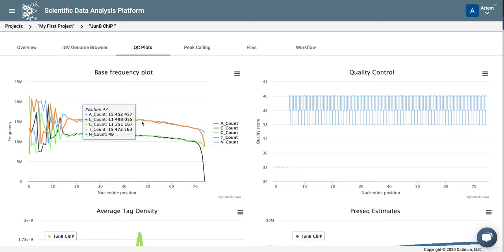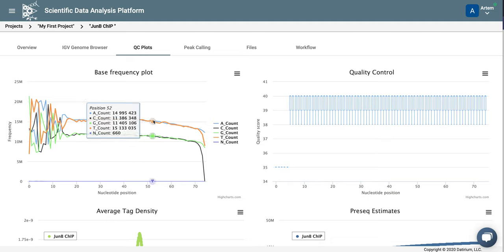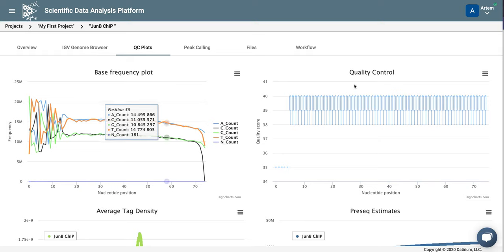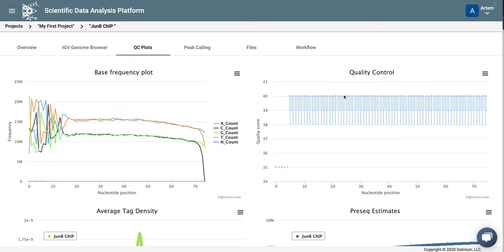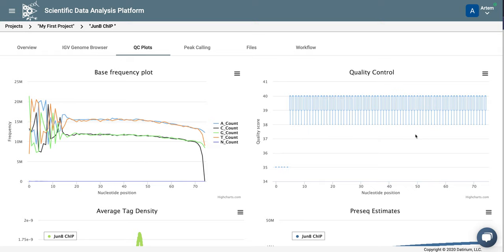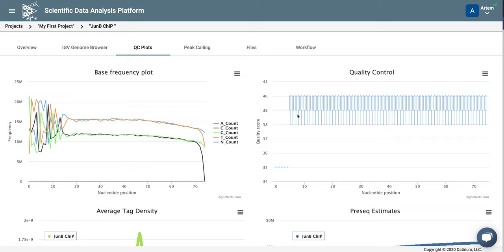Another control is quality scores for each base in the read. And in this case, quality is pretty good from 35 to 40.